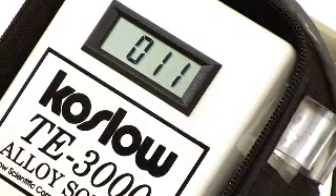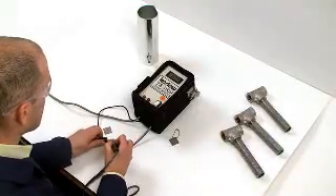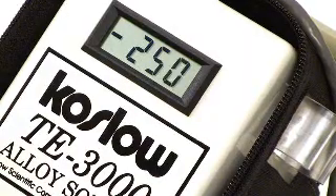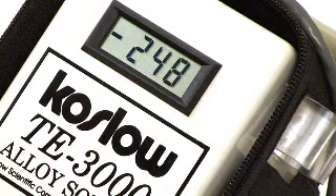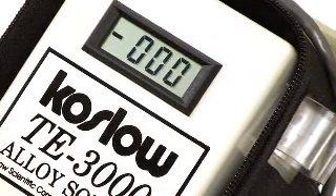316 stainless steel reads around 10, and Monel 400 reads around minus 250. All we're really looking for is a difference of 10 points between two alloys for this instrument to be considered effective.